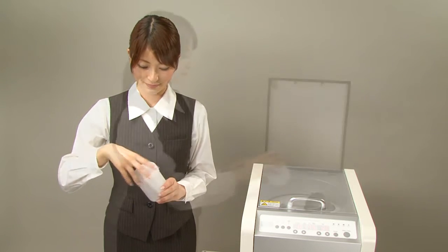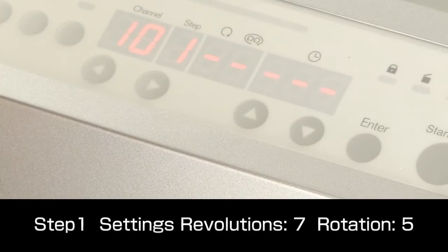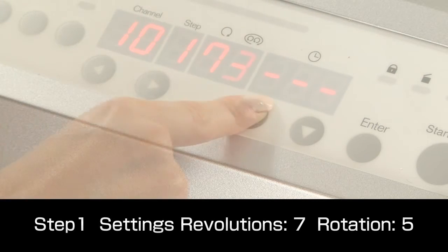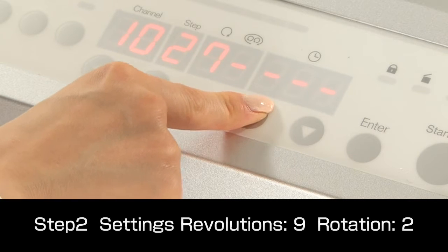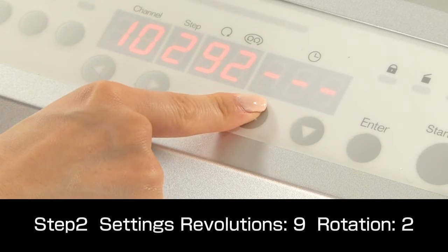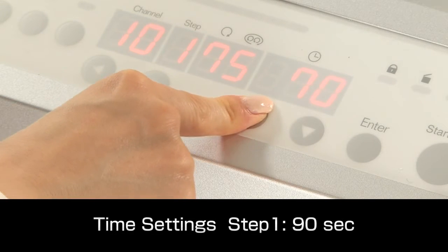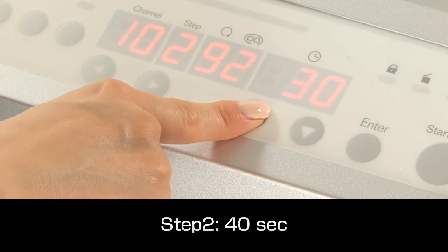The container with the materials is set in the holder and the lid is closed. First, for step one, we set revolutions to speed level 7 and rotation to level 5. This will mix the powder and resin to keep lumps from forming. Then, for step two, we set revolutions to speed level 9 and rotation to level 2 to thoroughly mix and degass the materials. The time for step one is set to 90 seconds and 40 seconds for step two.